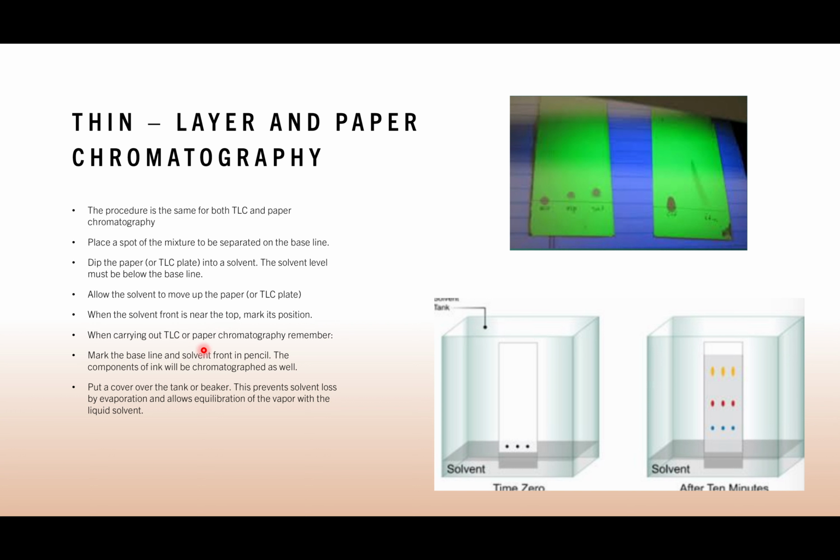When carrying out TLC or paper chromatography, please remember to mark the baseline and the solvent front with a pencil. The components of ink will be chromatographed as well. So if you use any type of pen, that will be chromatographed. We don't want that to happen.